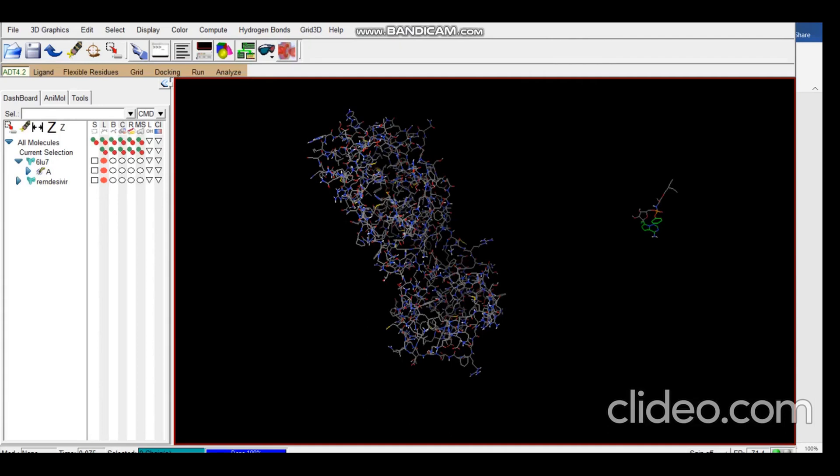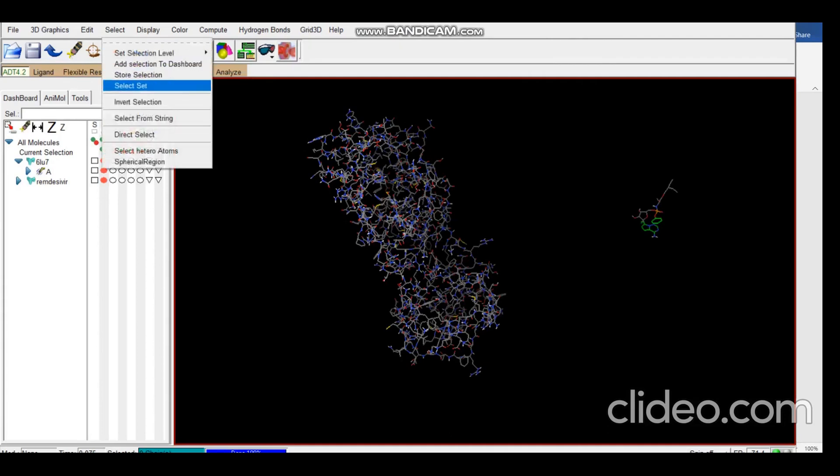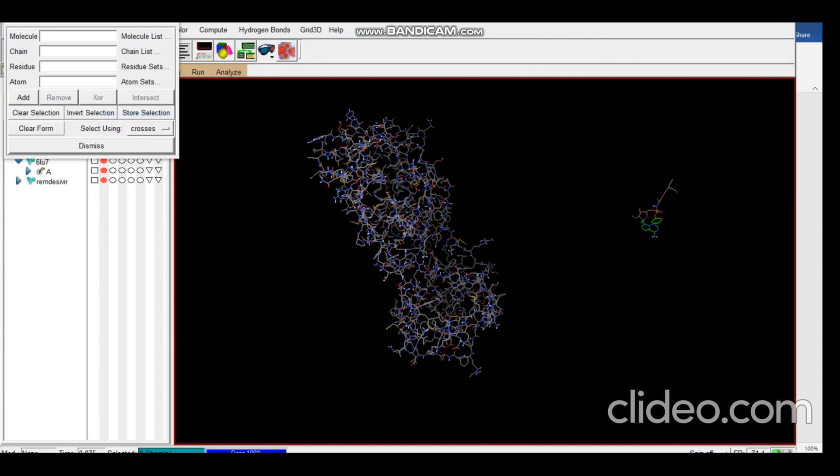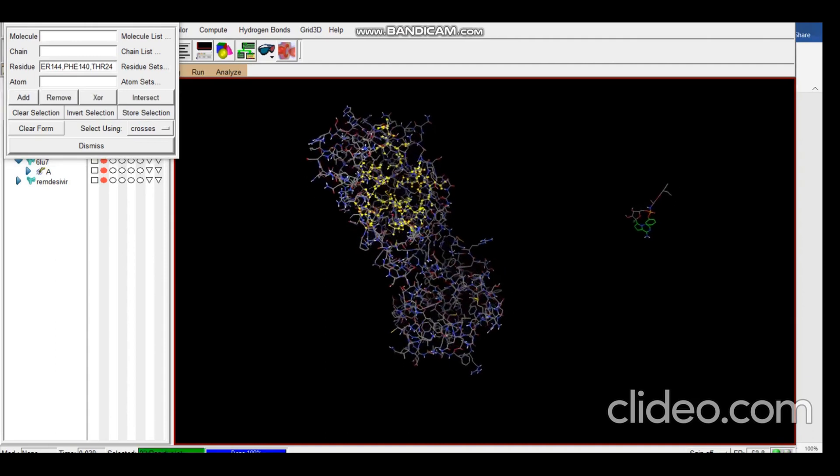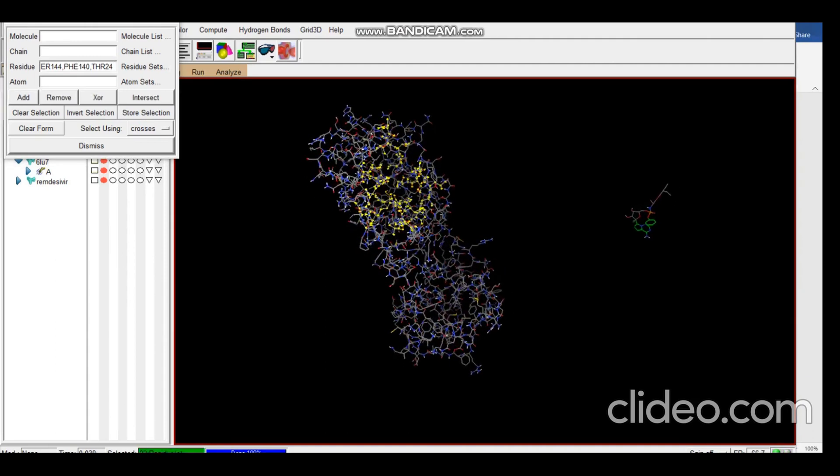We come back to the AutoDock window, select Select from String, Residues, and we just paste it and then add. So here you can see these are the residues which are marked in yellow. These are our active sites. Dismiss.